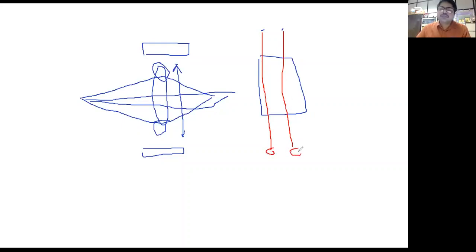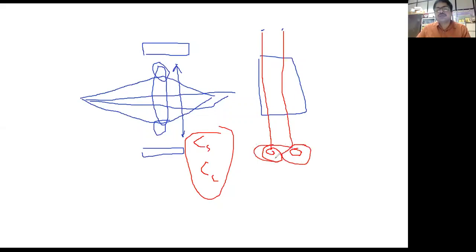So when you buy a microscope, you ask the vendor, what is my CS or CC? That is basically the spherical aberration coefficient, and CC is basically the chromatic aberration coefficient. Those are the selling points. The larger this number, the larger will be the disk. So then they will start merging and you lose the resolution, right?